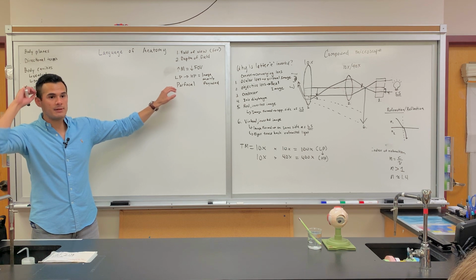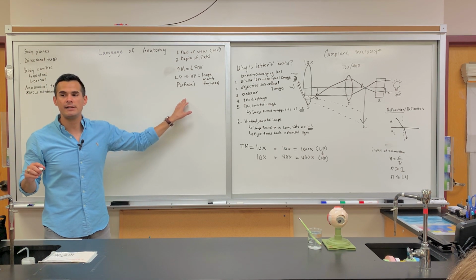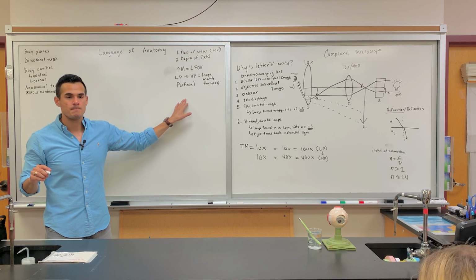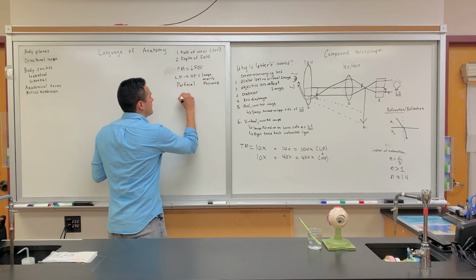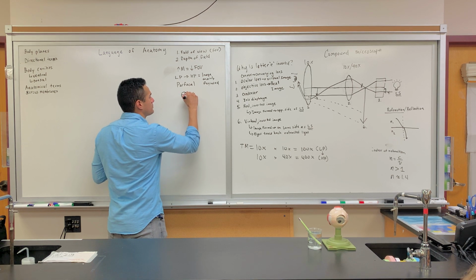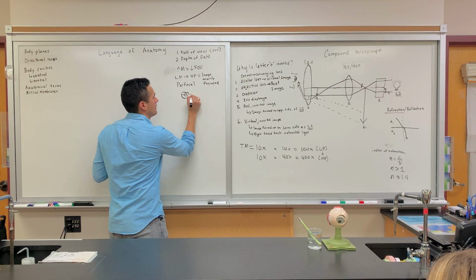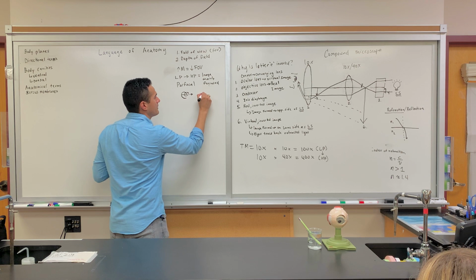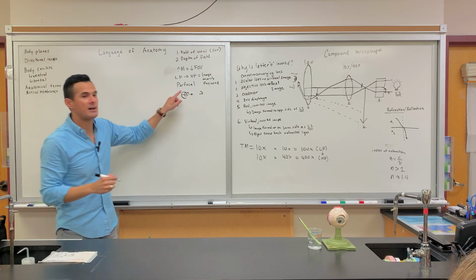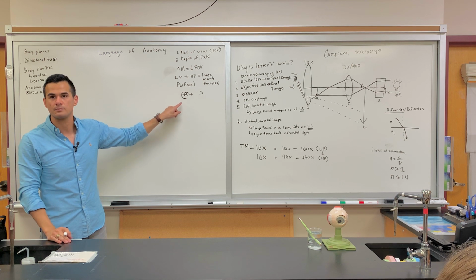Okay, so now tell me what you see for the letter E. Can you see all of the letter E? No, you can't. So I'm just going to draw the regular E, not inverted, just to simplify. But when you switch to high power, you're zooming in on this particular region of the letter E. So what it'll look like is something like that, because you're not able to look at the entire letter itself.